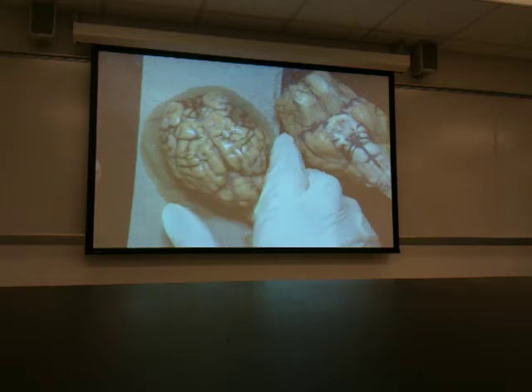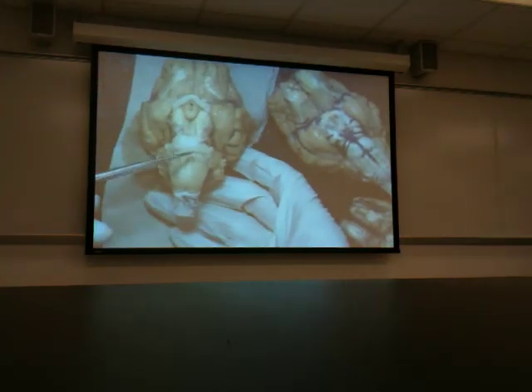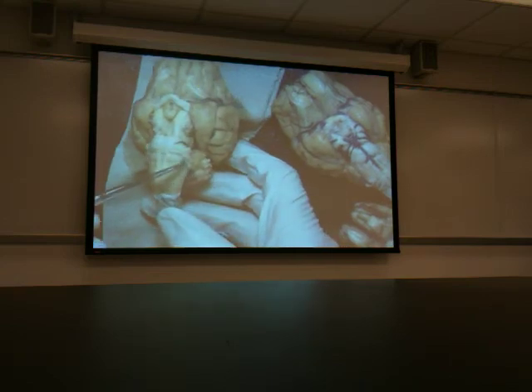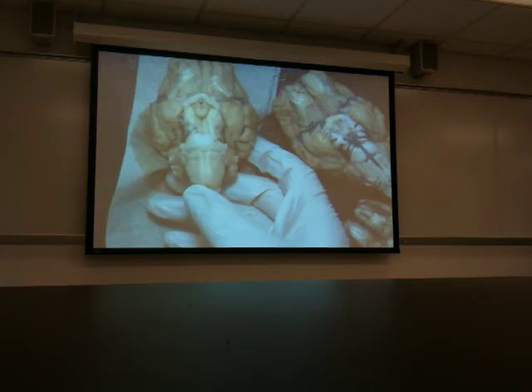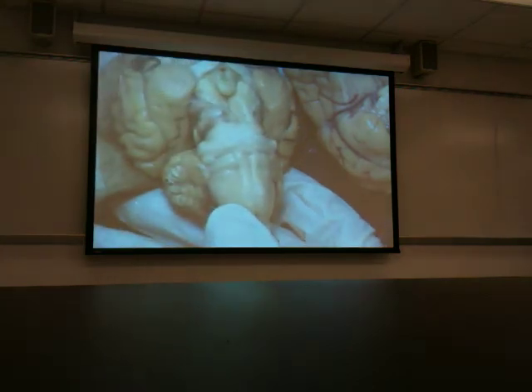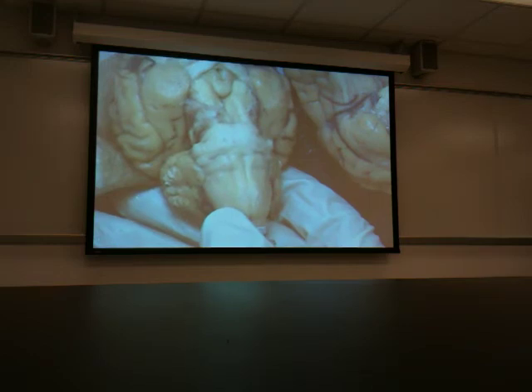All right. Now I'll show you dura mater in a little bit, but I want to go back to this medulla oblongata that has an incredibly well revealed trapezoid body. Do you see that? That ridge, that raised area? Shall I zoom in? Is it better if I zoom in for you like that? Yeah? Okay. So do you see that ridge, this raised area here? That is the trapezoid body.